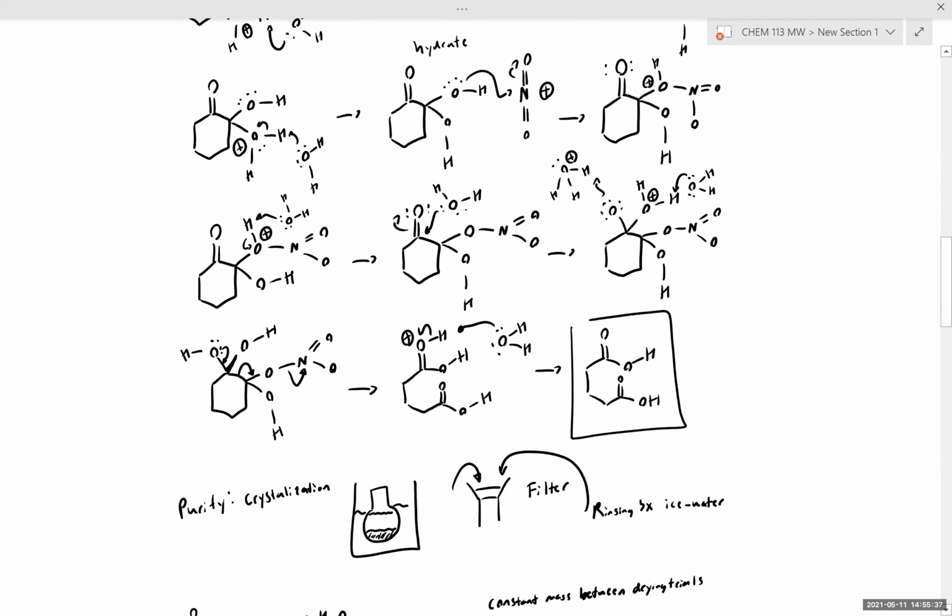Now, one thing that I would also like to comment on is that this reaction is quite exothermic and requires elevated temperatures in order to proceed. So operationally, you'll notice the majority of the recording, in fact, I cut out about half an hour of me adding the cyclohexanol just so that the recording was as to the point as possible.